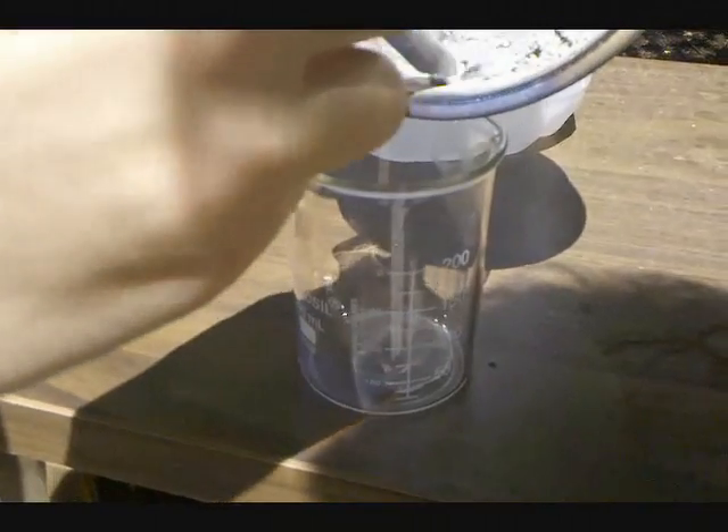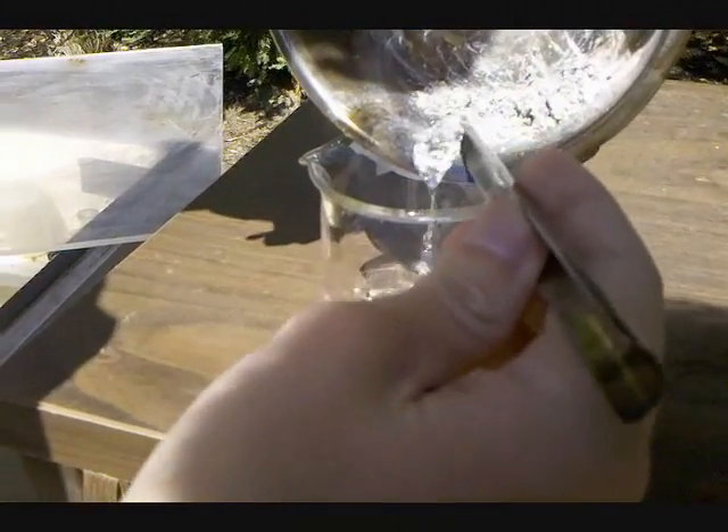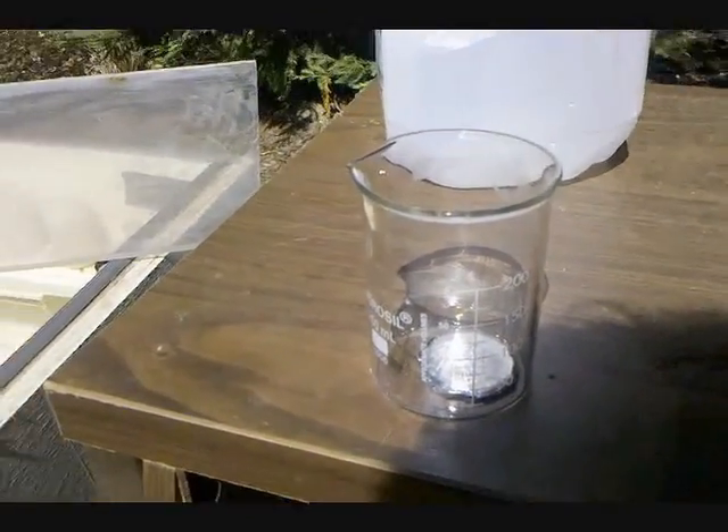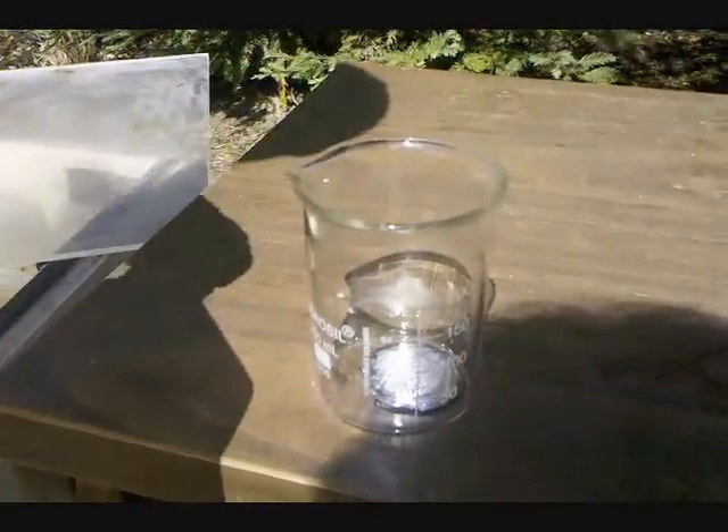Alright, now the alloy is done. You can see some excess aluminum in the chamber where I made it. Pour that into a beaker. Now, you can observe the reaction when I add water.